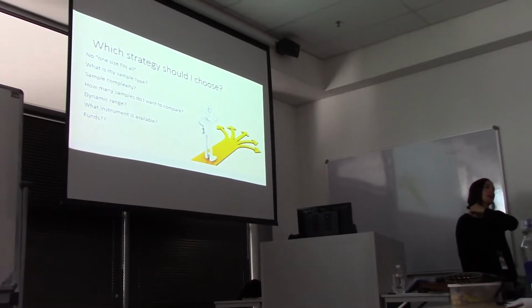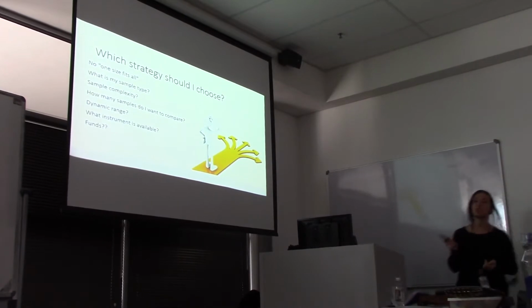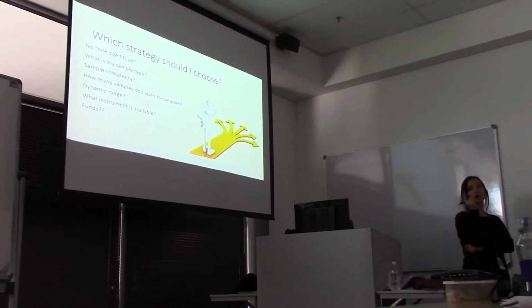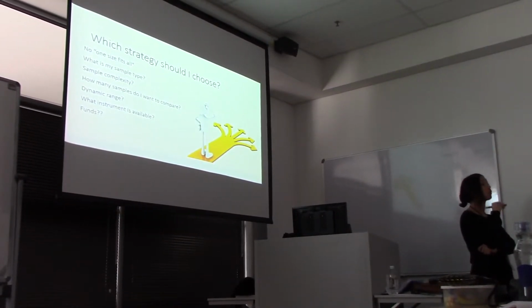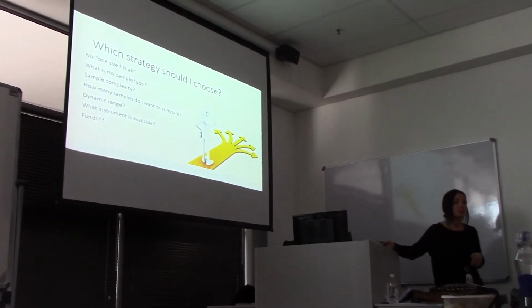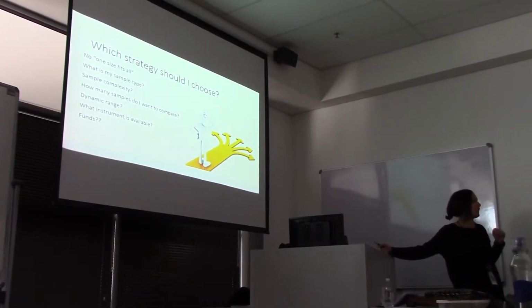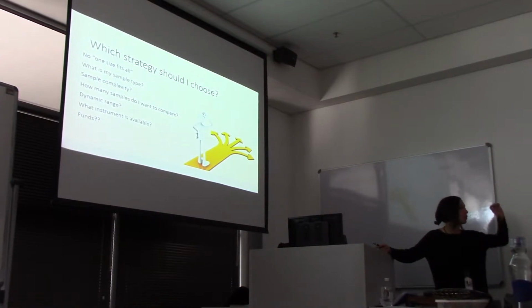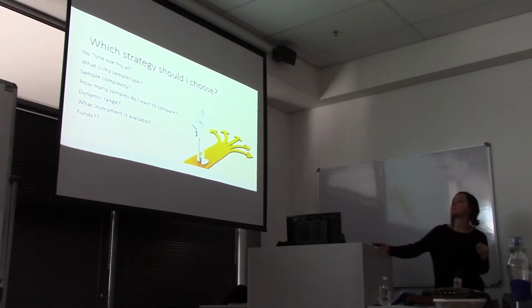But you need to decide, what do I want, what do I need, and what do I need to analyze. So what is my sample type? Sometimes the sample type is what limits you. Maybe, for example, Hygon works on saliva. Saliva notoriously has a lot of amylase. It's just chock full. In fact, no one likes to do proteomics on saliva. I don't know if his supervisor hates him or what, but salivary proteomics is notoriously difficult. So he is having to look at maybe just separating out on the gel so you can cut out that amylase band and then deal with the rest of the sample.